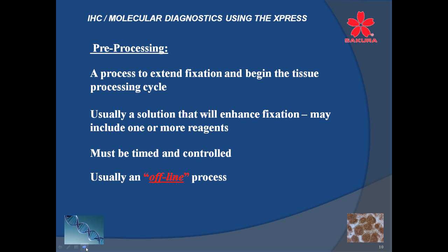And you're going to hear more about that in just a moment as we talk more about some of the fixation areas. Usually, a solution that will enhance fixation. It may include one or more reagents, and I want to talk a little bit about the reagents momentarily and give you a little bit of insight that we really don't have anything new. We're still using some very unique reagents and have been for quite some time.